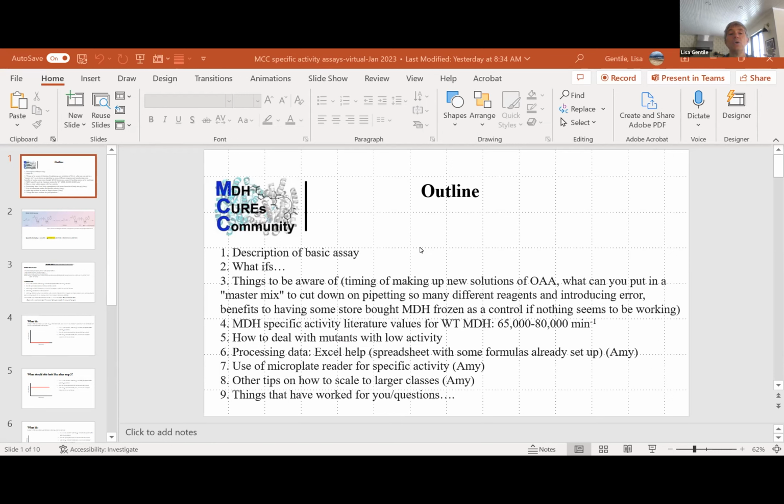I know a number of you are working with mutants of MDH, as am I, and just some suggestions in terms of how to work with low activity that I've come up with, but you may have more that you can add in as well.